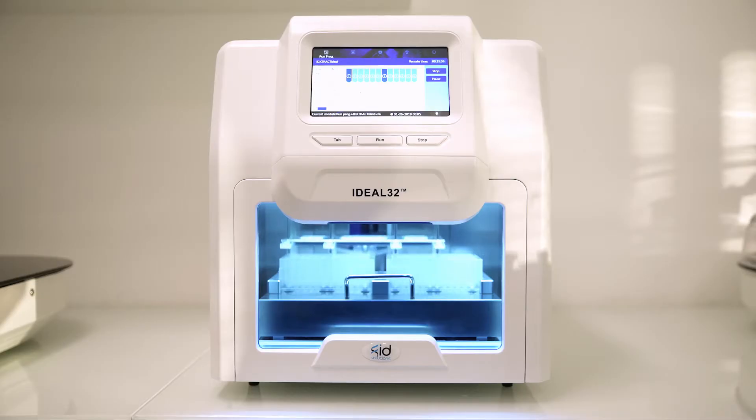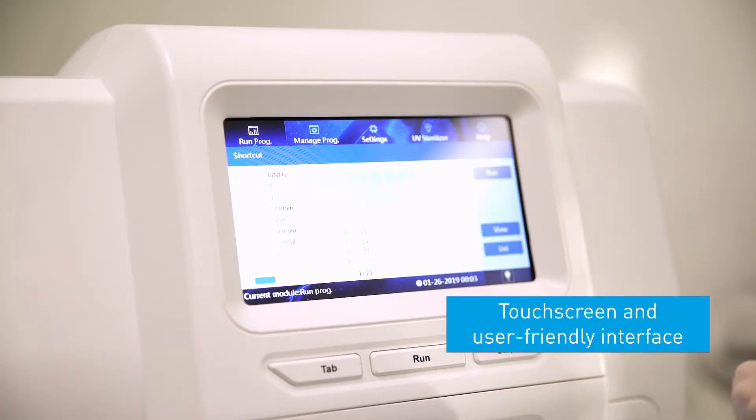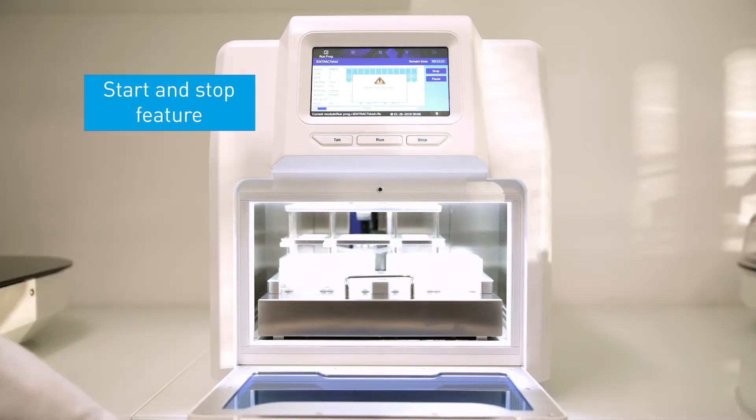The Ideal 32 robot also extracts nucleic acids from sample volumes ranging from 20 microliters to 1 milliliter. The device is easy to use with a touch screen and user friendly interface. This machine also includes a start and stop feature.